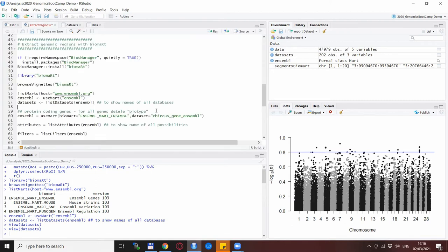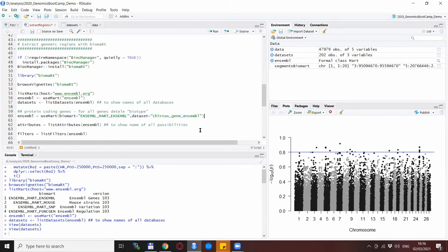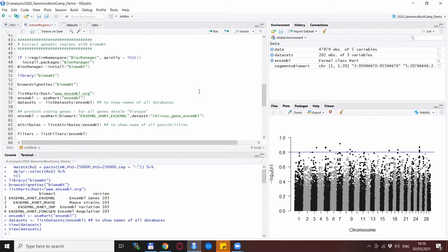In the next step we specify that we are interested in the protein coding genes and we are using the dataset, the goat dataset as we extracted before from the previous set. Another interesting point is which attributes you want to have for your regions of interest and if you don't know then you can look at the full list and decide yourself which attributes you are interested in.